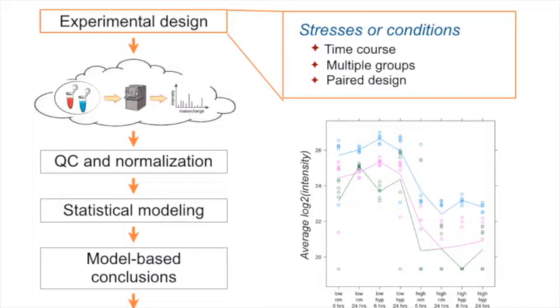And we really should not underappreciate that, because as we said last week, if things go wrong here, no amount of hard work later will compensate for problems. So essentially, it can be a wasted experiment at best and completely misleading and wrong conclusions at the worst, right? And irreproducible conclusions.